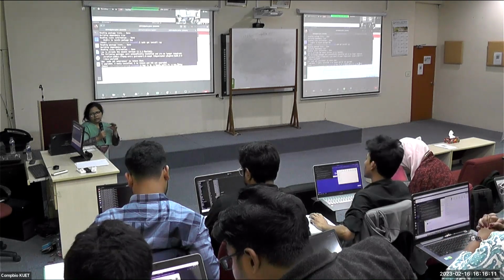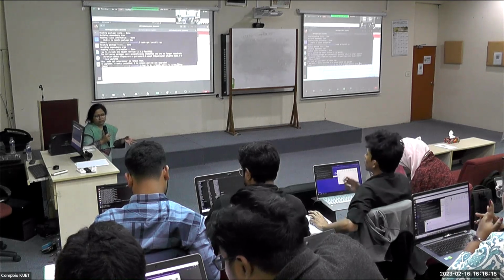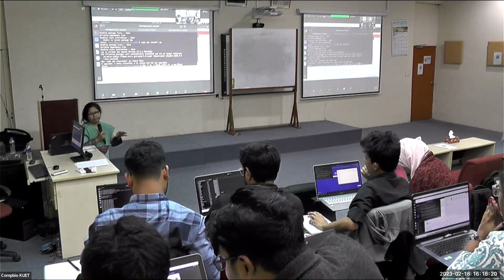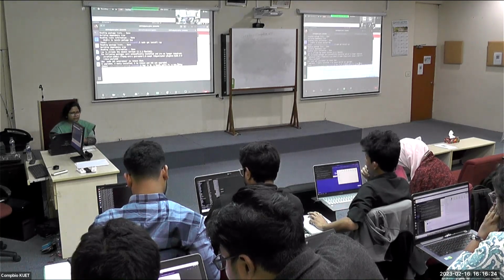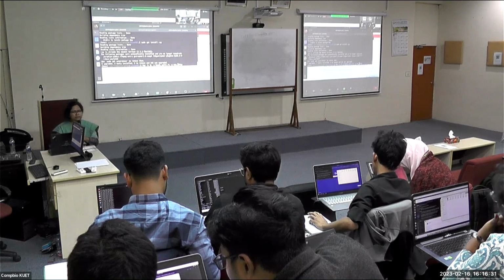Because from genome sequencing, you will get a lot of sequence files, and that will take time. But since we have limited time here, we will just go with a few of the FASTA files. Okay, so everyone could write this command.